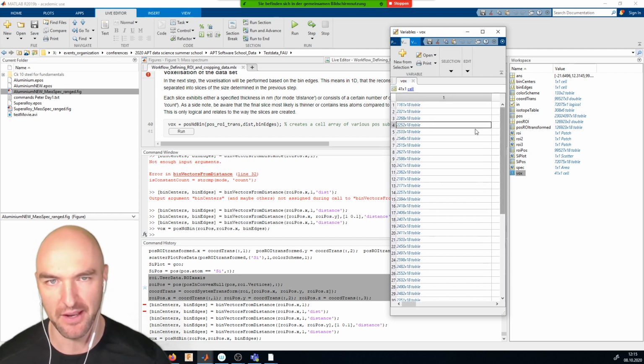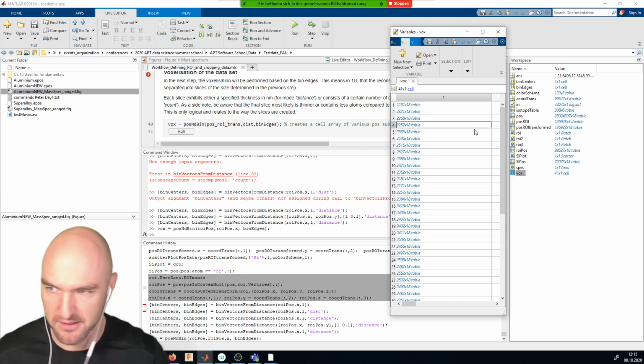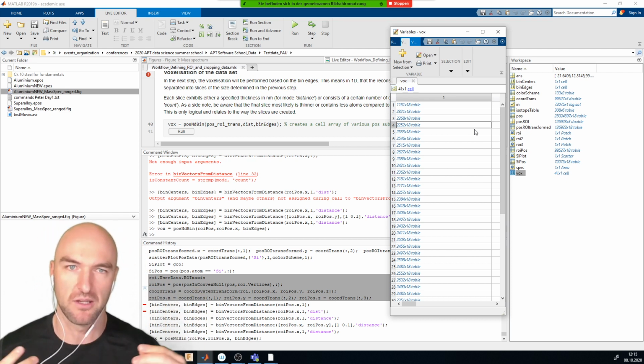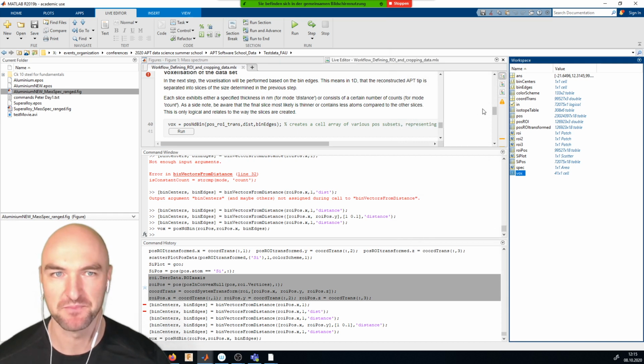And I think you can very easily see that you can do that in whatever dimension you want. So you can do that with XYZ, you can do that with evaporation sequence, you can do that with detector coordinates, you can do that with, you name it. I'm not very creative, so these are the things I came up with right now.